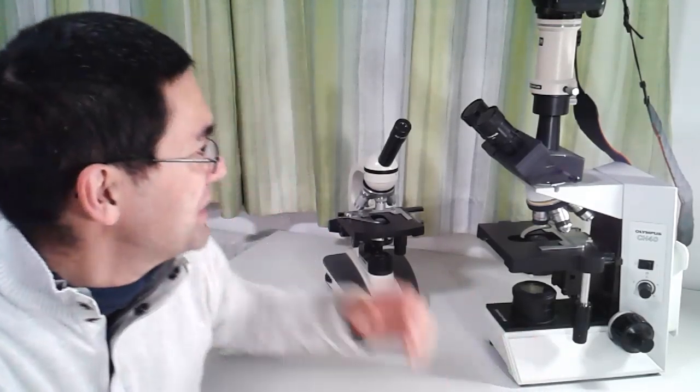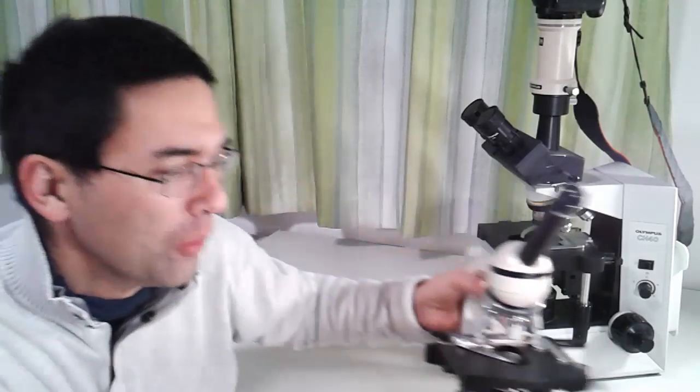So hello and welcome. There are many questions that have been asked already concerning bacteria. What microscope do you need to be able to see bacteria? Are you able to see bacteria, for example, with a simple, relatively low cost and straightforward microscope like this one over here? That's a common question. So what do you need to invest in, in order to see bacteria? And what magnification do I need?